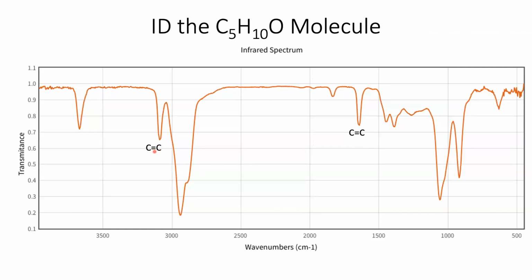But what on earth is my oxygen doing? I've got 2 major options. Either it can be attached as an alcohol, or it can just be part of an ether. So I'm going to look to see if I can identify an alcohol. And lo and behold, I have a peak around 3700, decently broad, decent intensity.